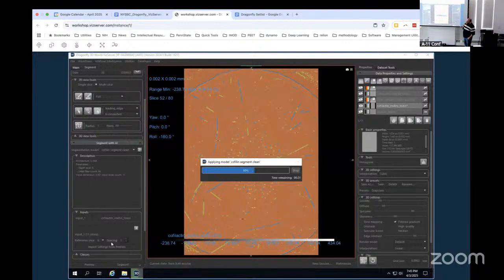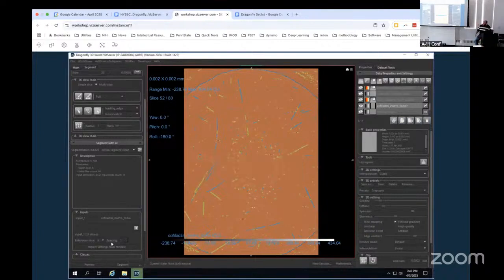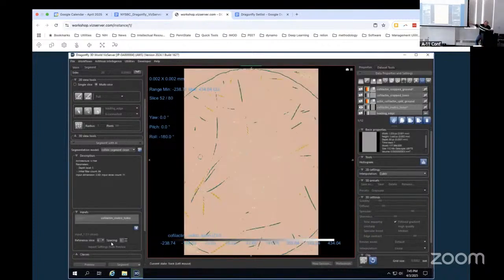It depends on what you're trying to do. One of the next things we'll do is open up the data from neural seg, which is like blocks of data that we generated. And there it was very iterative, right? We would add new data, because what happens is you make this network work, and then you apply it to some other data, and it doesn't work really well there.